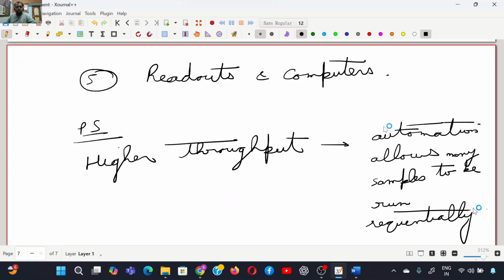PMT already told, high signal to noise ratio. Double beam AAS modulation you have to learn. Most of them are directly from source notes, okay?